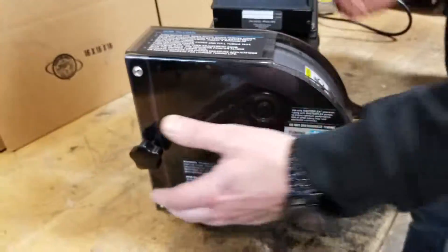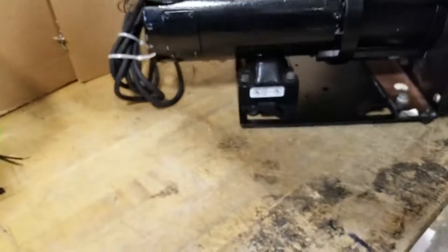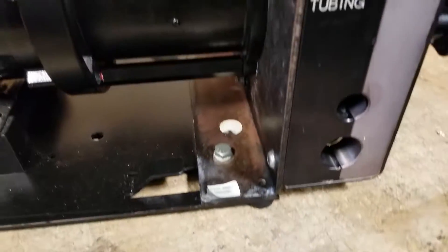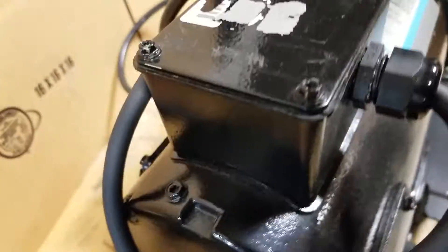If you want to just rotate it so I can — very clean piece of equipment. You'll be able to read this better in the ad. I'll have snapshots — they don't say snapshots anymore, they say screenshots.